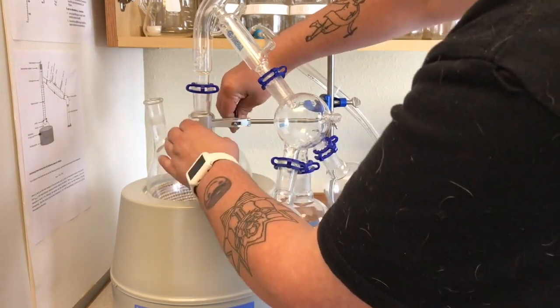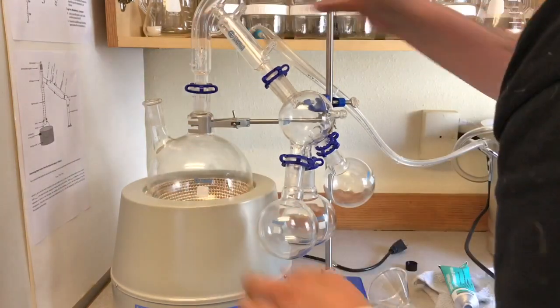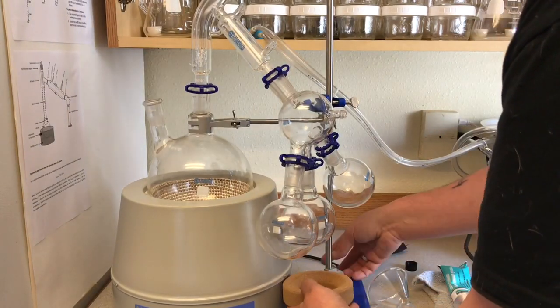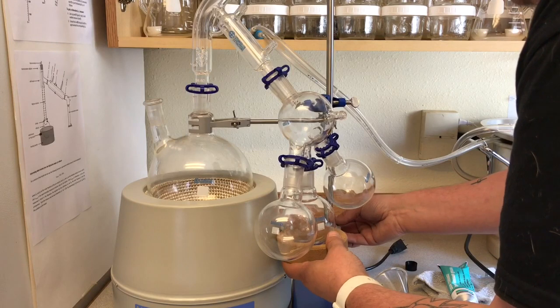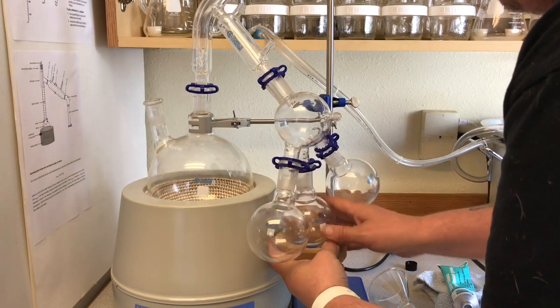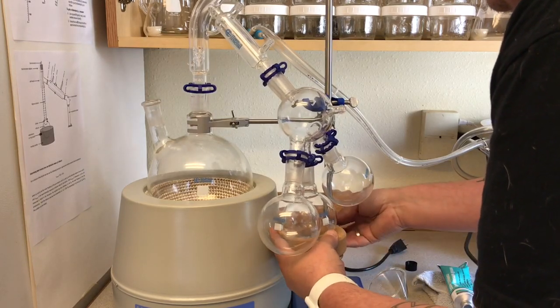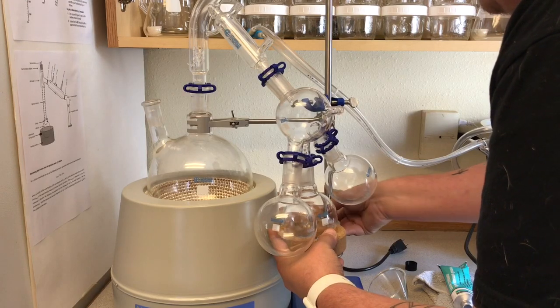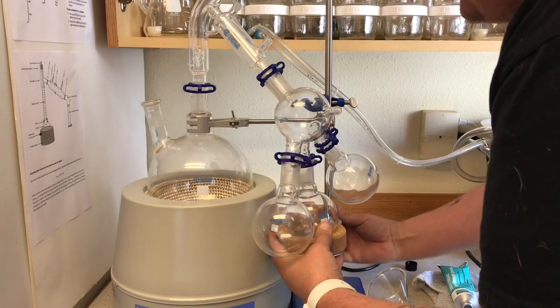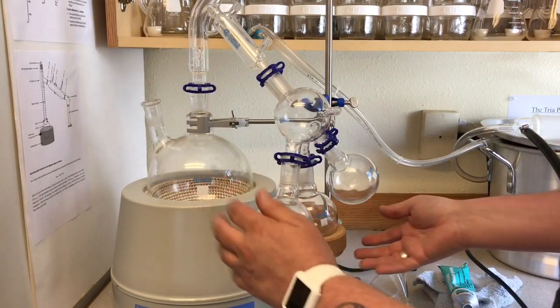Okay. You don't want a reef on this guy, but you do want it nice and tight so that he's not going to be moving around too much. I'll go ahead and add that piece of cork to the bottom of this guy. And sometimes it takes a little practice to finagle in each piece exactly where it needs to be. And before we actually start our process, we'll make sure that this cow has a nice free swing, that it can swing back and forth.